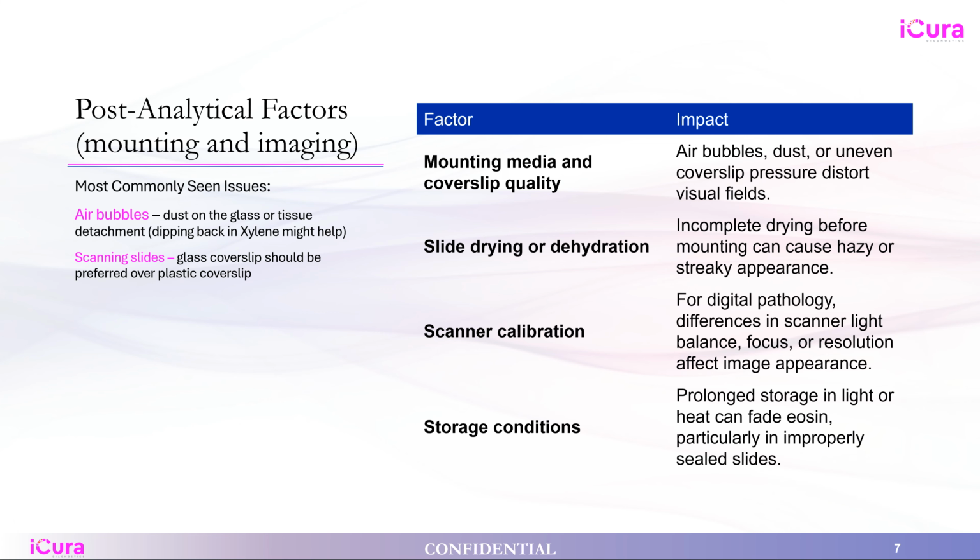For post-analytical factors, there are also some details you want to pay attention to. For example, when you're applying cover slips to the glass slides, you want to avoid air bubbles. There are certain things you can do to avoid air bubbles. And in a lot of labs these days, digital pathology is mainstream, and you want to scan the glass slides into whole slide images. There are also many technical details you want to pay attention to, but we won't be presenting or discussing these in today's presentation.